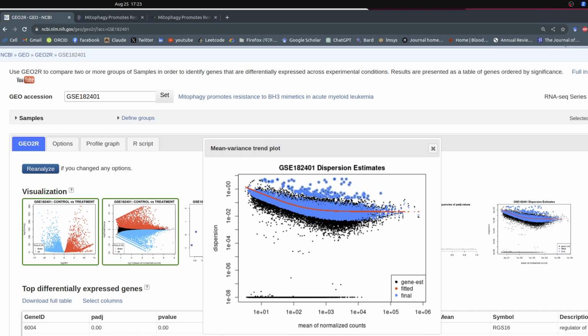It looks good. And when you did the control versus treated and you went through the genes in here, the DESeq, which has used the negative binomial modeling to generate this entire analysis, looks well fitted in here, based on the genes and their expressions.